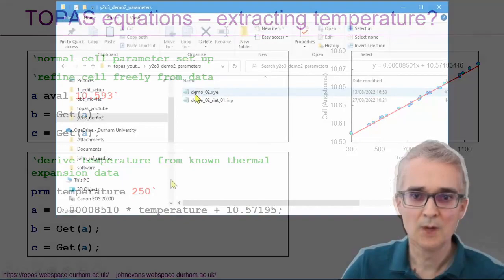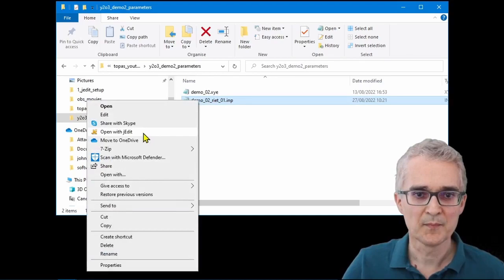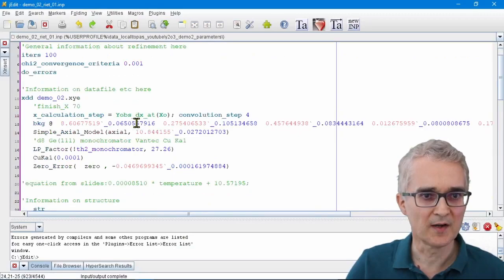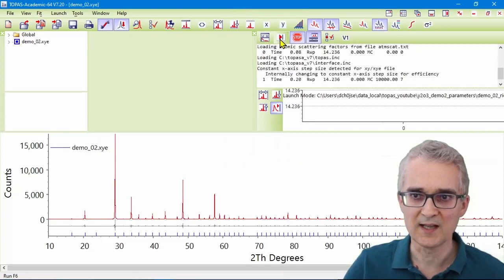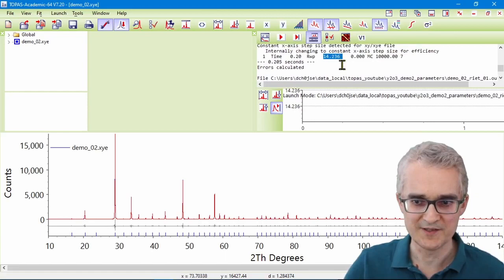So let's just try doing that in a simple example. So what I've got here is the input file that we set up previously for doing this Y2O3 Rietveld refinement. So let me just open that in jedit. And so here's the input file that we had previously. Let me just send that to TOPAS and let me launch TOPAS.